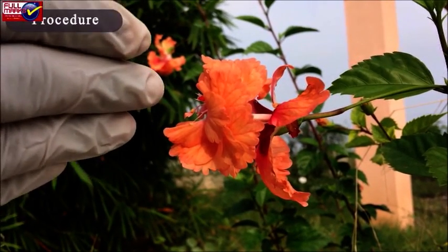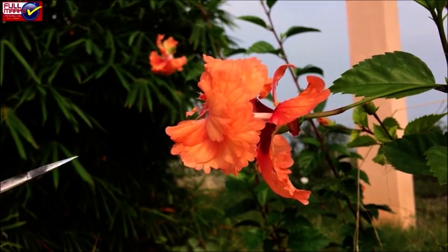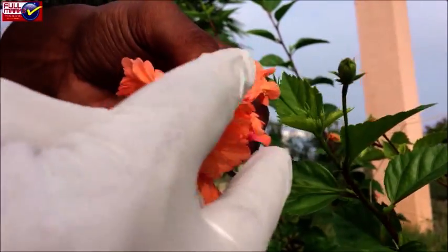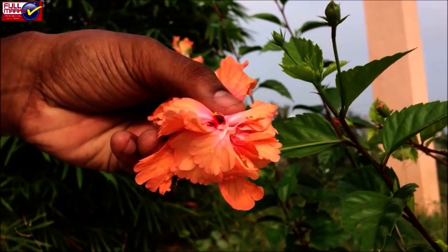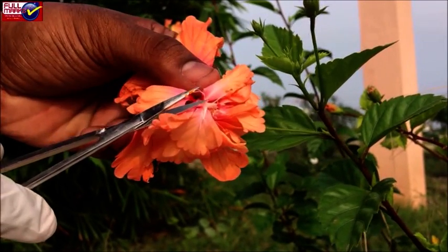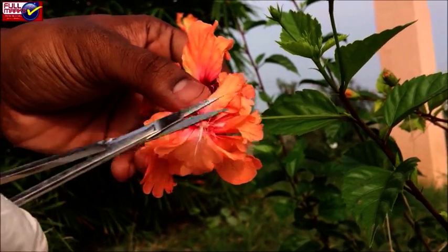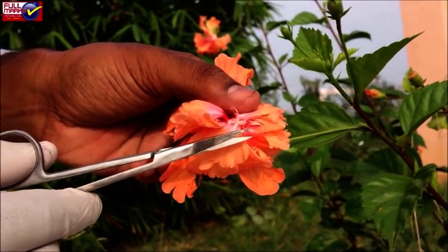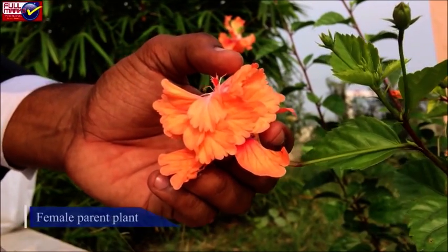Procedure: Select a good variety of plant. Now, select a flower in bud condition where anthesis has not occurred. Open the bud carefully and remove the stamens.